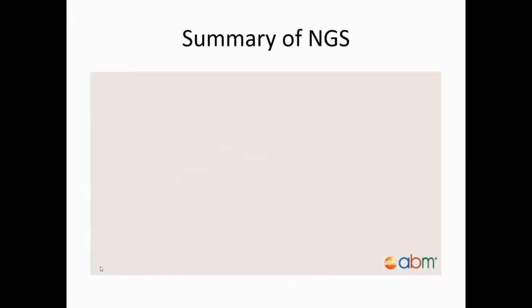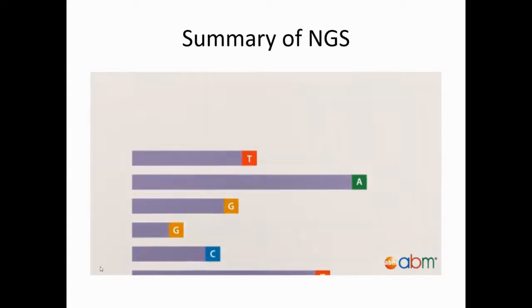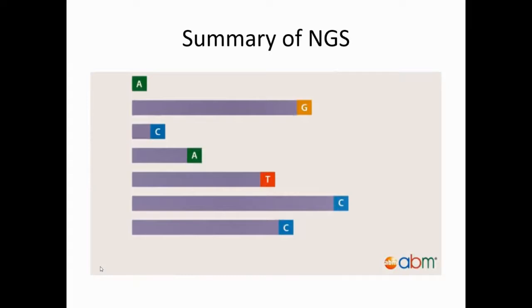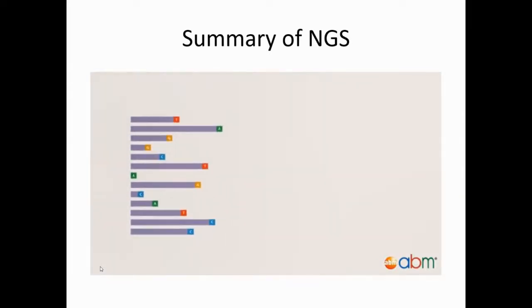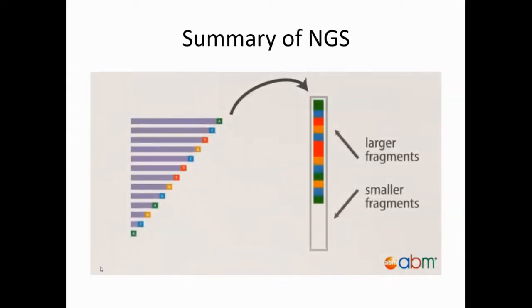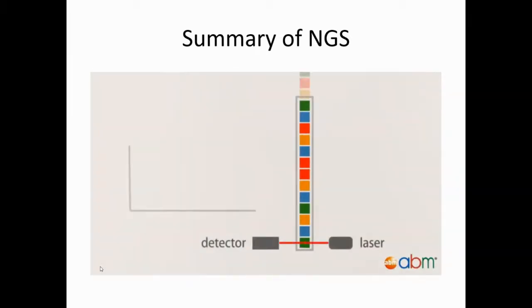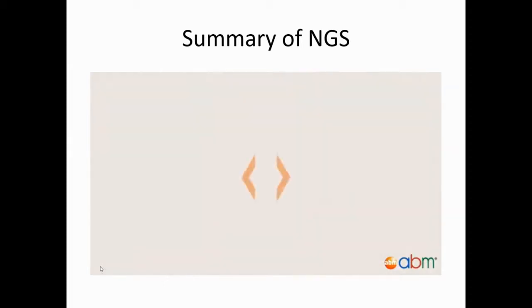of the DNA sequence. As a result, many copies of different length DNA fragments are generated in each reaction, terminated at all of the nucleotide positions of the template molecule by one of the dideoxynucleotides. The reaction mixtures are loaded on the sequencing machine, either manually onto slab gels or automatically with capillaries, and are electrophoresed to separate the DNA molecules by size. The DNA sequence is read through the fluorescent emission of the dideoxynucleotide as it flows through the gel. Modern-day Sanger sequencing instruments use capillary-based automated electrophoresis, which typically analyzes 8 to 96 sequencing reactions simultaneously.